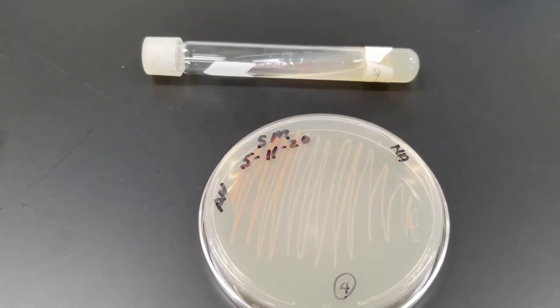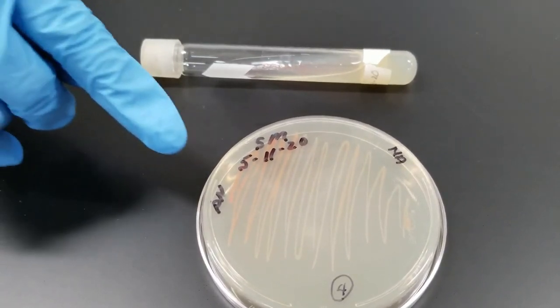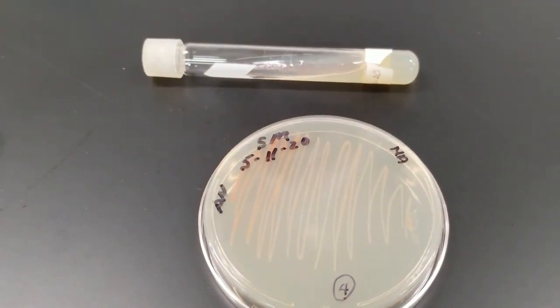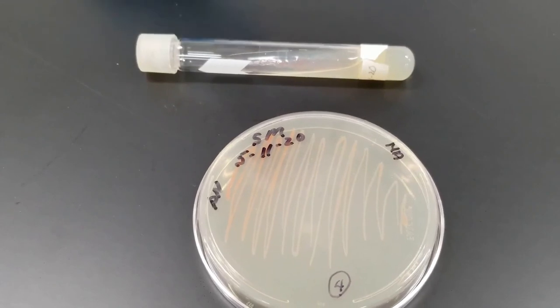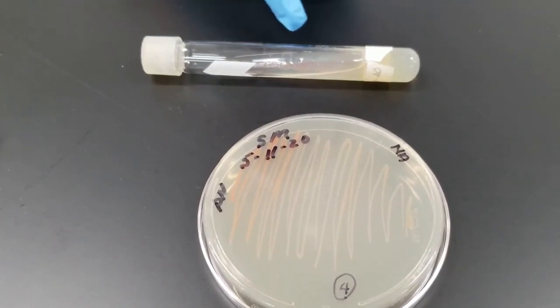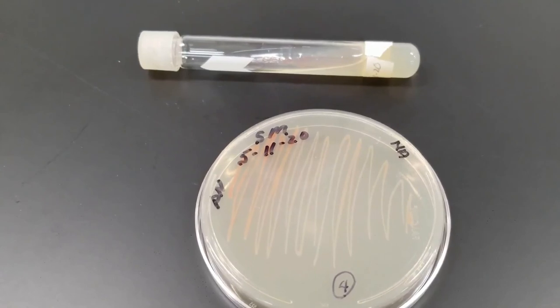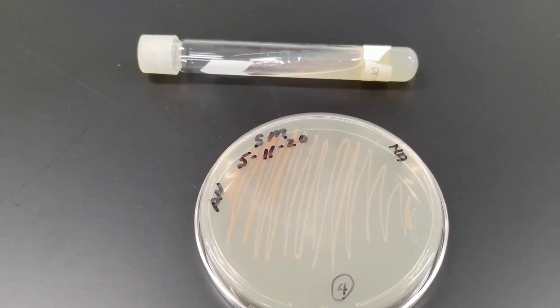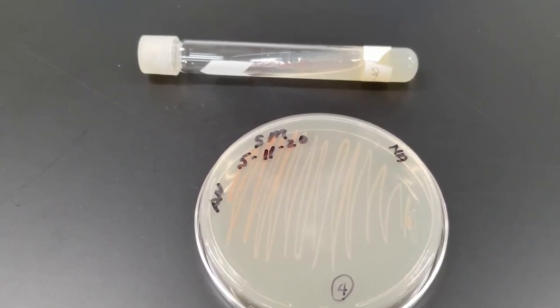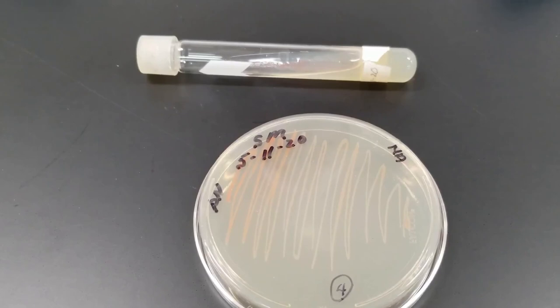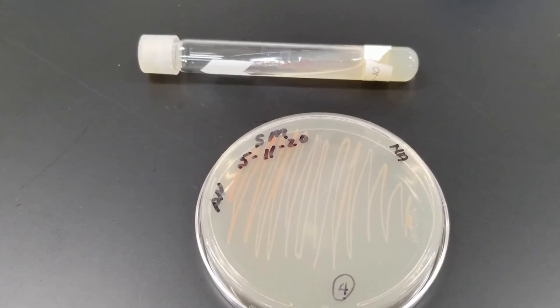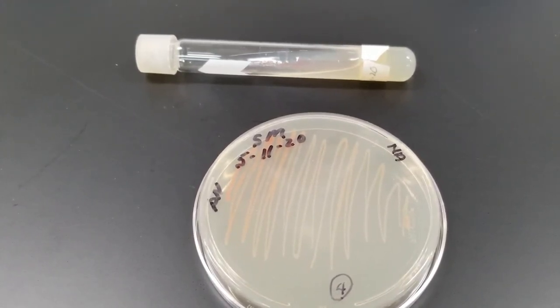But you can see on the plate the streak where we went with our loop. We have growth wherever the loop had touched. And also then on the slant. A lot of growth down at the bottom and then extends up along the slant towards the top. Oftentimes you will look at the different characteristics. Nice heavy growth there. Notice the color. One of the big things you will want to notice is the pigmentation. Whenever you have a bacterial culture you are working with that can give you clues as to the identification of it.